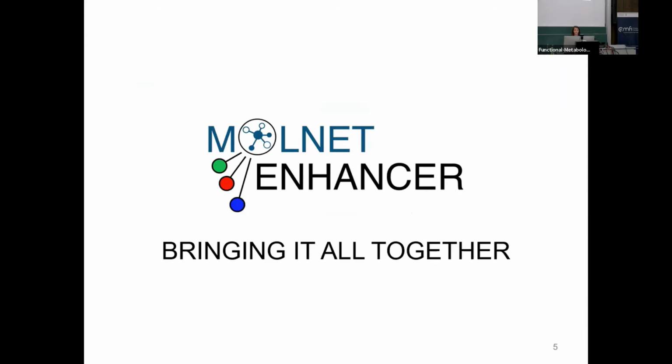We have a clinical metabolomics lab, and we'll be introducing a bit more about our work tomorrow as well at the stat session. But what I'll be showing right now is the MolNetEnhancer workflow. This is a workflow I designed together with Justin and collaborators during my postdoc at Pieter Dorrestein's lab. So this is all work from the past, basically.